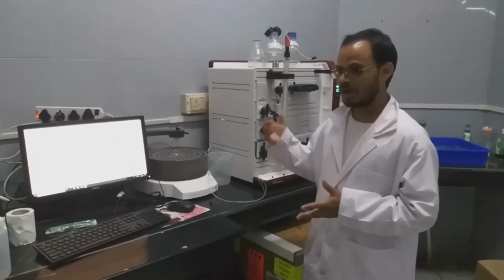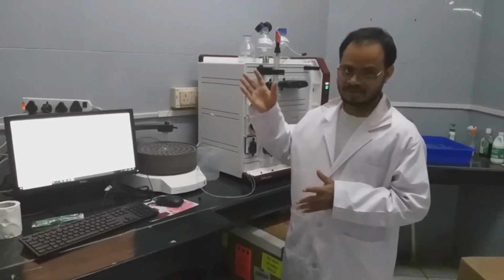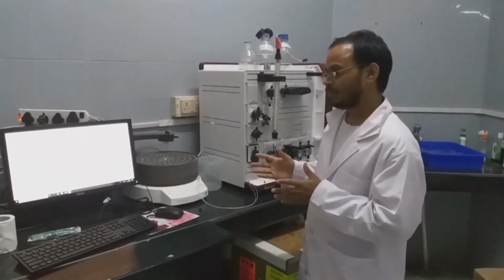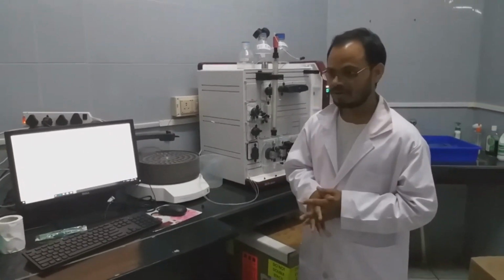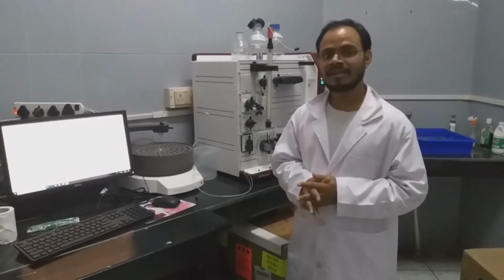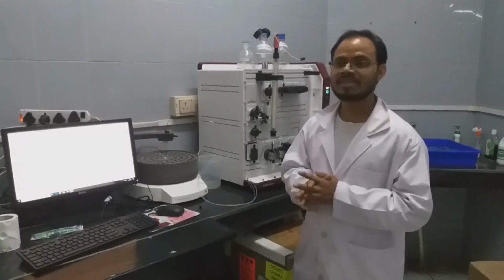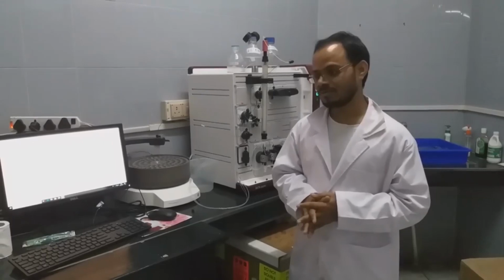phosphate buffer, and you have water, and you have not equilibrated with the phosphate buffer, then you cannot expect good resolution or good separation of the proteins. Also, the proteins may not be stable in other conditions like water, so they may degrade or they may not be useful if you are interested in the enzymatic reactions. So that's why we always equilibrate the column with the same buffer in which our protein of interest is dissolved.